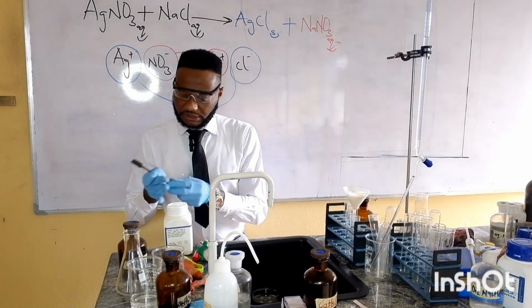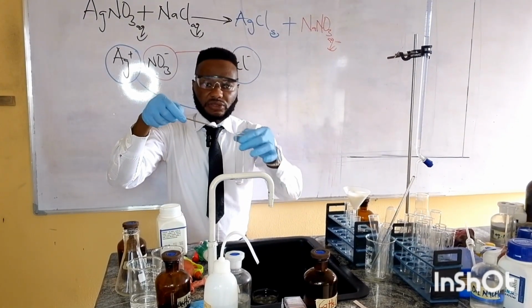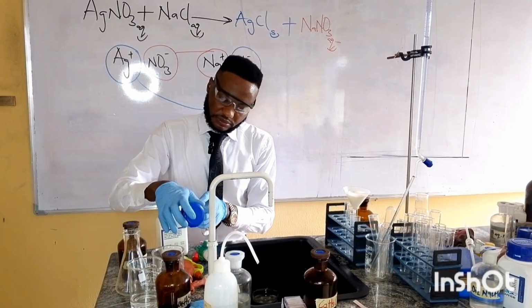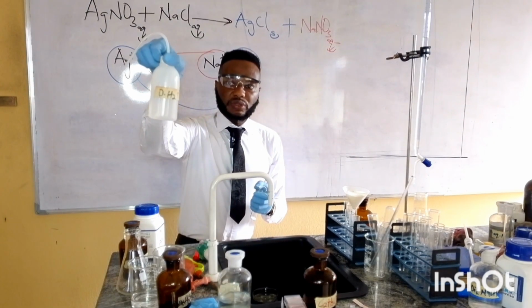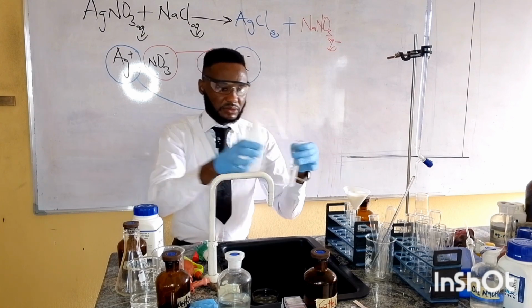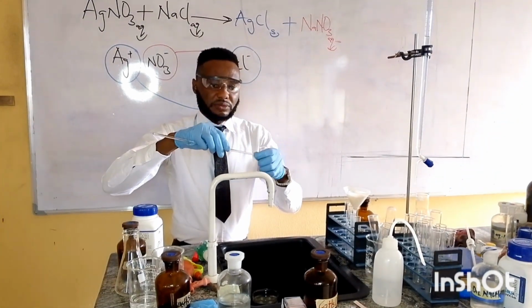Okay. Then this is my salt. Then we have to dissolve it. This is my distilled water. So we stir.